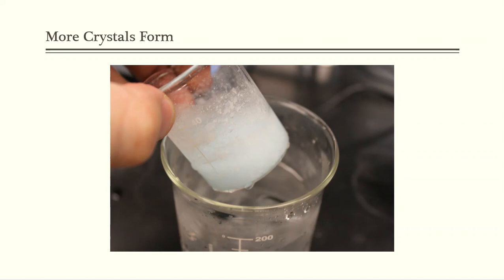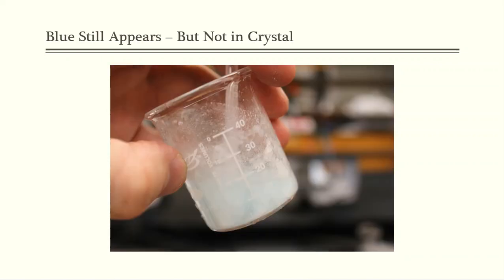in those crystals. As I take the beaker out of that ice water, once more, I see quite a bit of white crud that is there, but I'm not going to call it crud or crude product at this point. This is now a completely recrystallized product here.